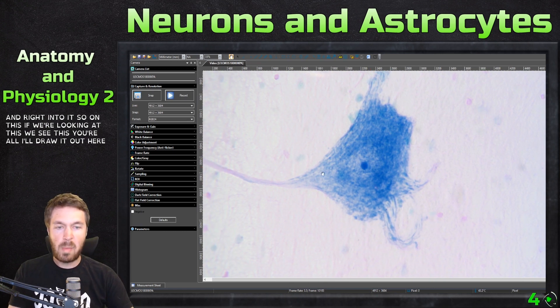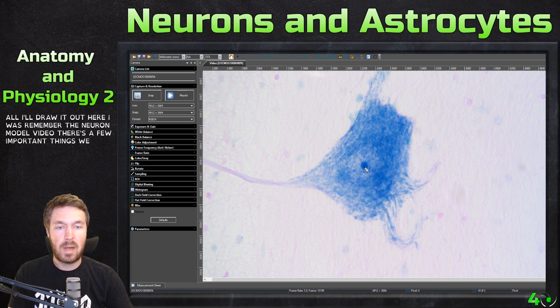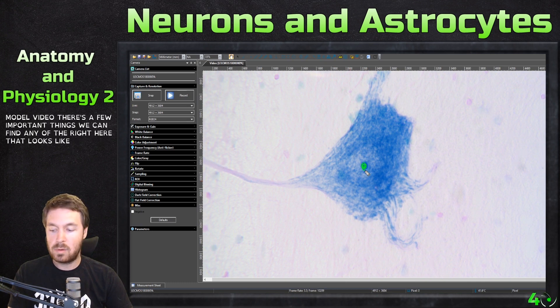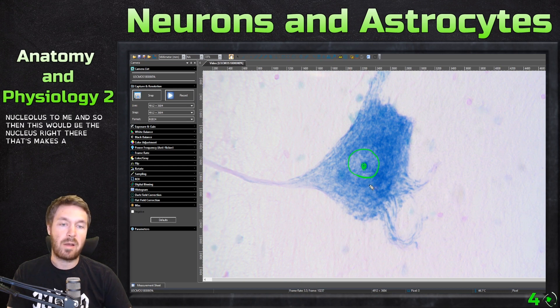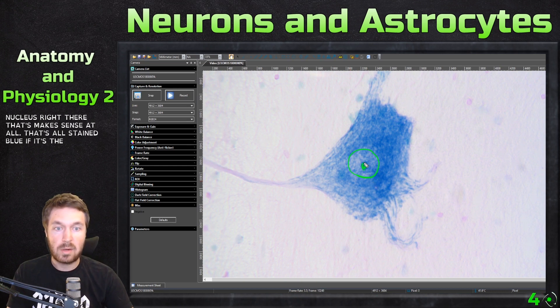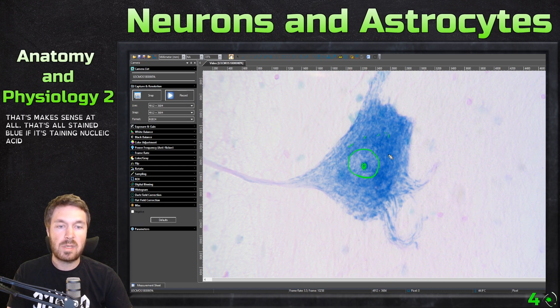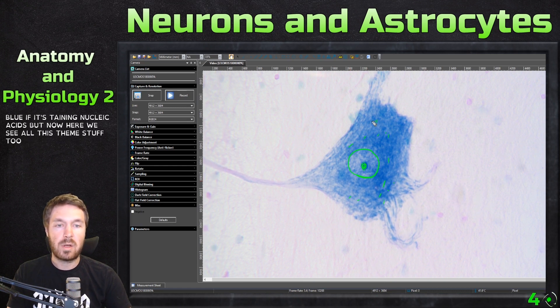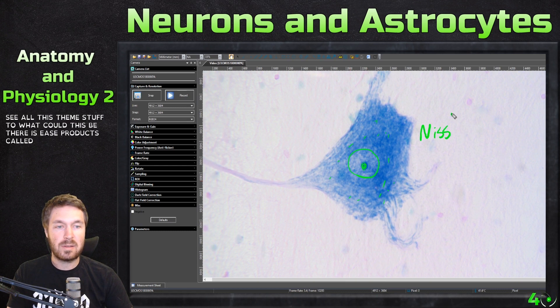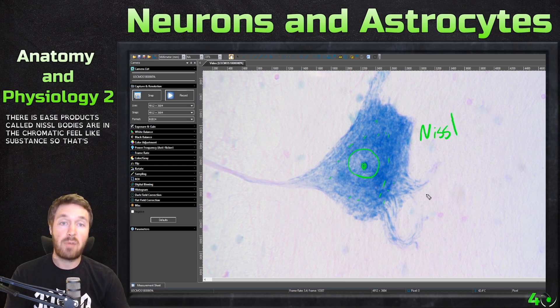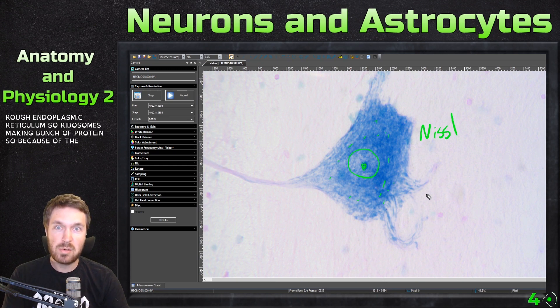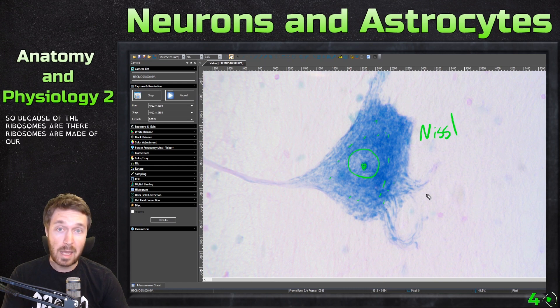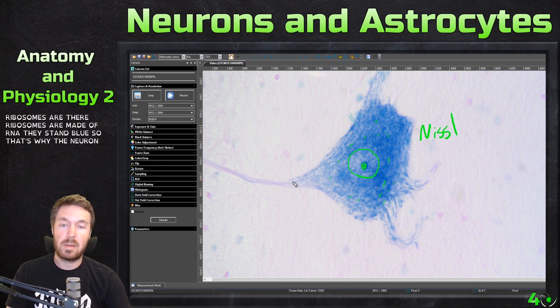I'll draw it out here. If you remember the neuron model video, there are a few important things we can find. Right here, that looks like the nucleolus to me, and then this would be the nucleus. That makes sense that it's all stained blue if it's staining nucleic acids. But here we see all this other stained stuff too — what could this be? These are called Nissl bodies, or the chromatophilic substance. That's rough endoplasmic reticulum — ribosomes making a bunch of proteins. Because the ribosomes are made of RNA, they stain blue too. That's why the neurons stain blue.